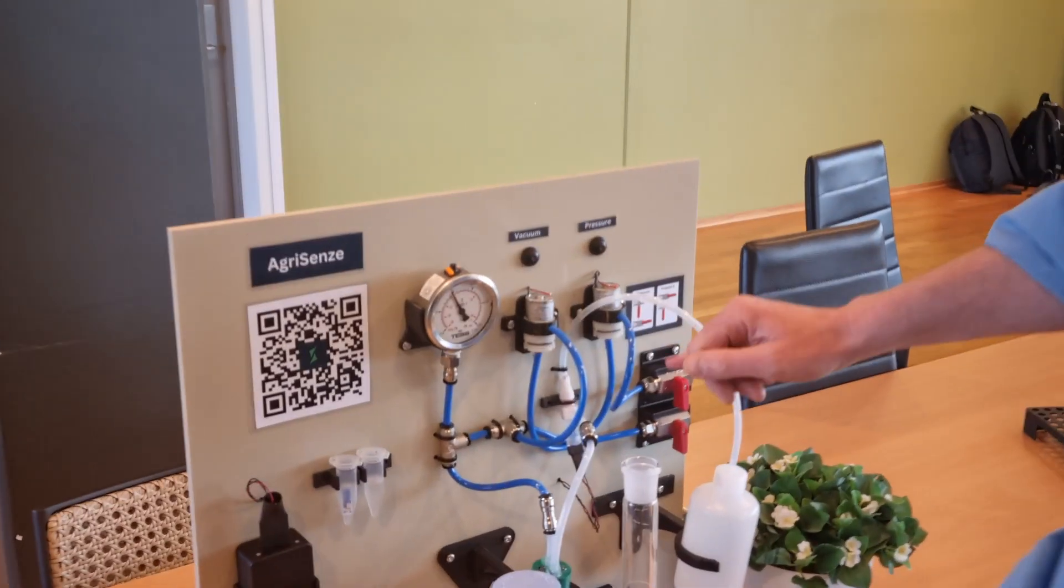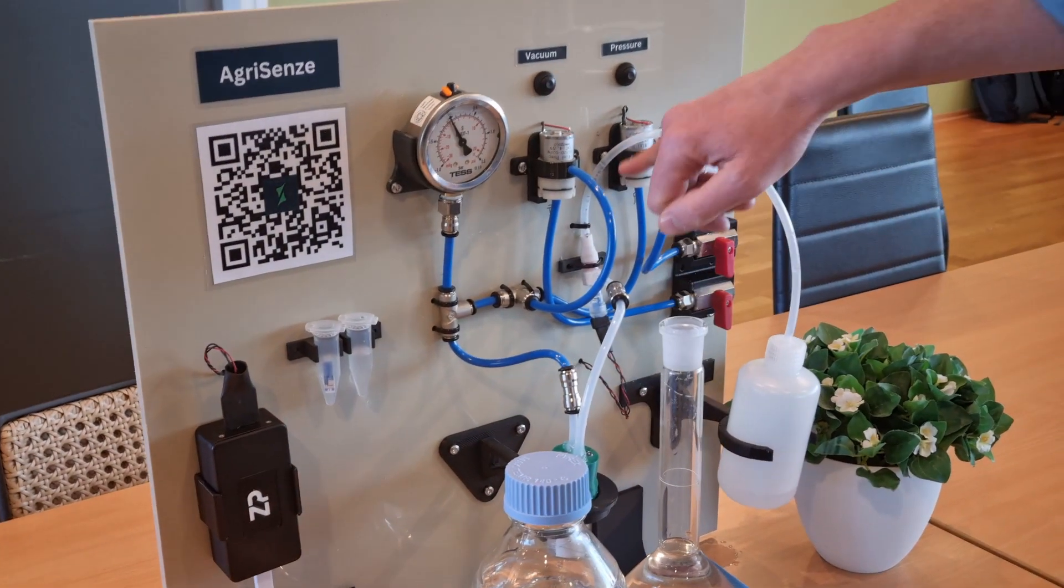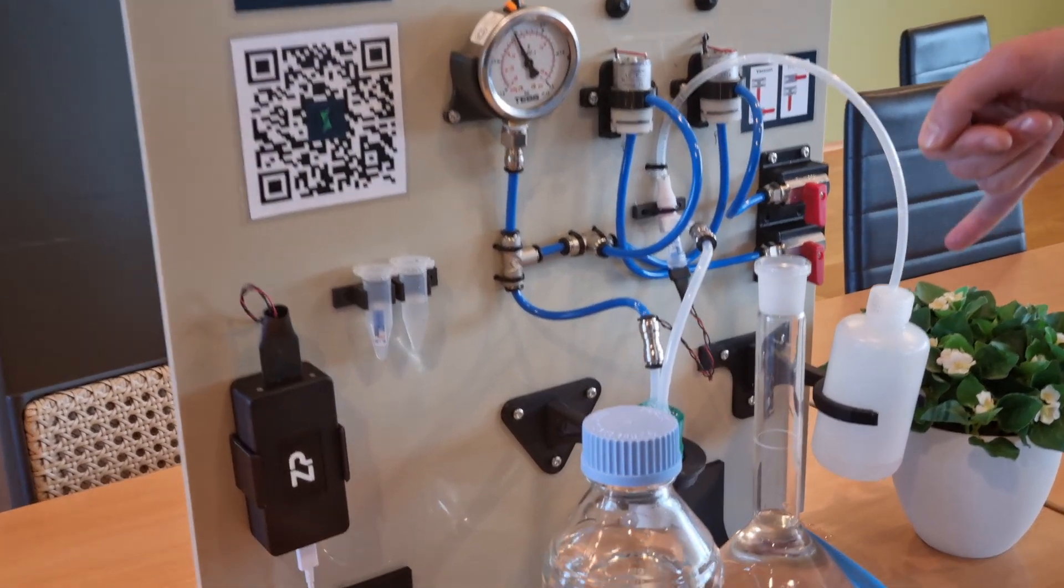If you were watching the fluidics here you'd understand that it was going over the flow stream and going to waste.